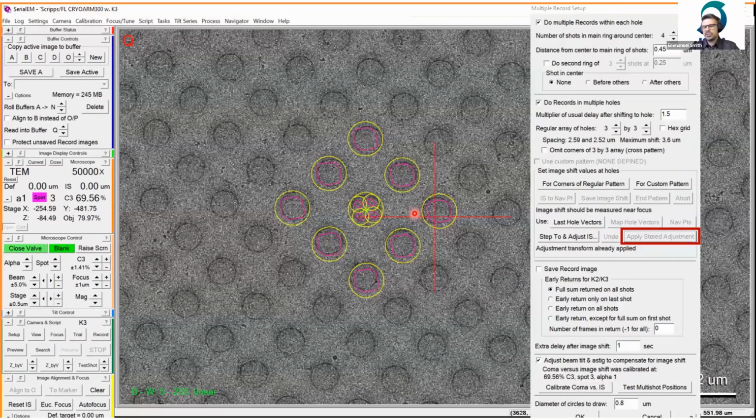All right, so in the context of multigrid, this is important because as long as SerialEM has the vector information for every sample that comes in, it's going to run the map hole vectors on a square image, and it's going to apply the adjustment factor. And it seems to translate very well and to be quite robust. And we get very good targeting, even with our systems that have fringe-free illumination. And we're doing multiple acquisitions within each hole.